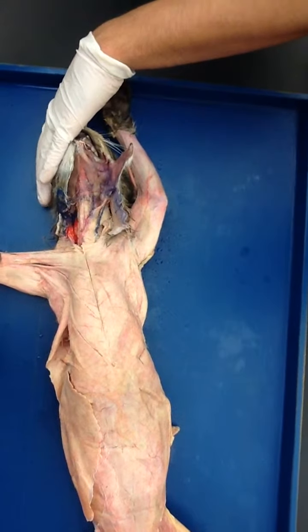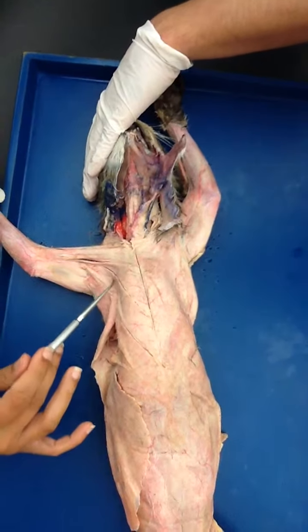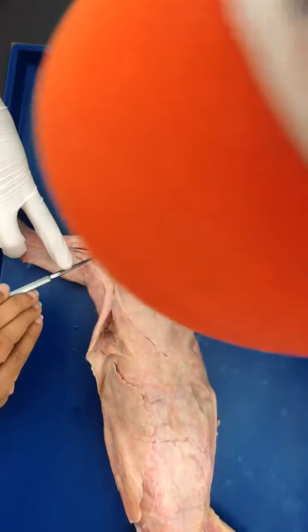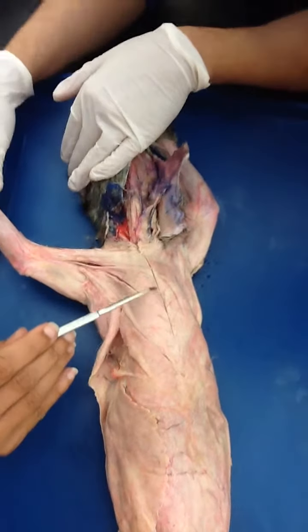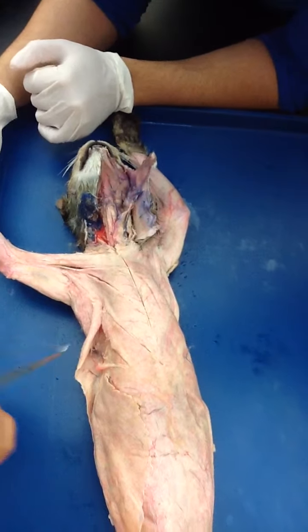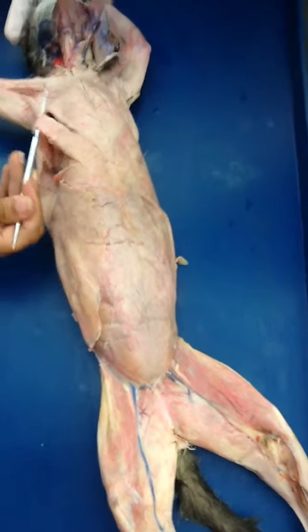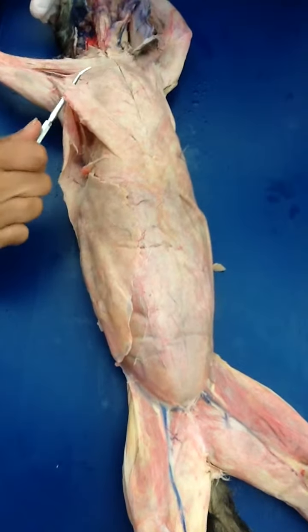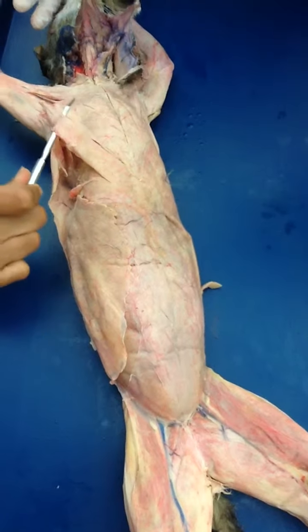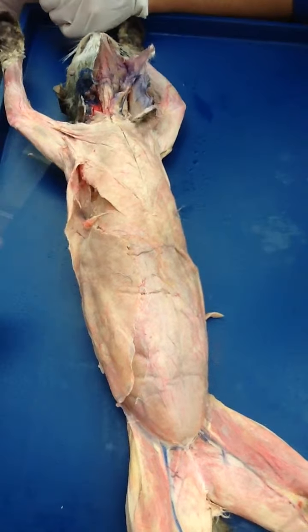This one is pectoantebrachialis. This one is pectoralis major, and the bigger one is pectoralis minor. And this is xiphihumeralis, because it is going to the humerus. So if you pull it, the arm is going to move. So this is xiphihumeralis, going to the xiphisternum.